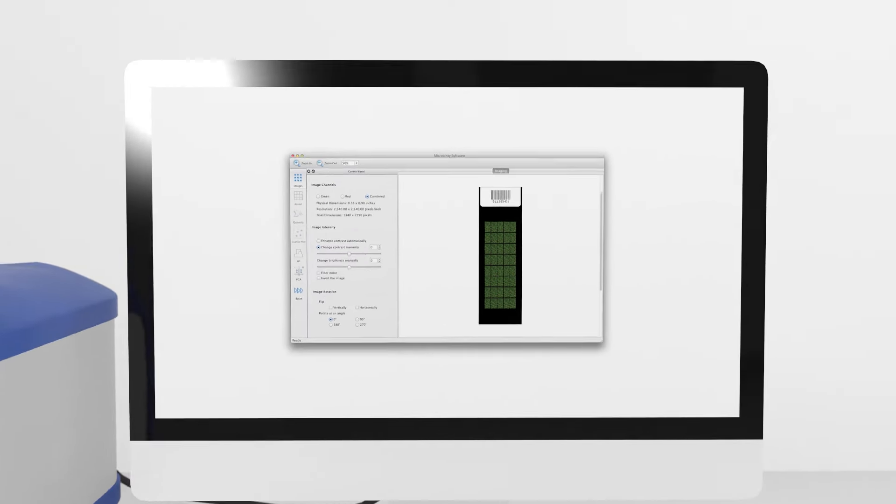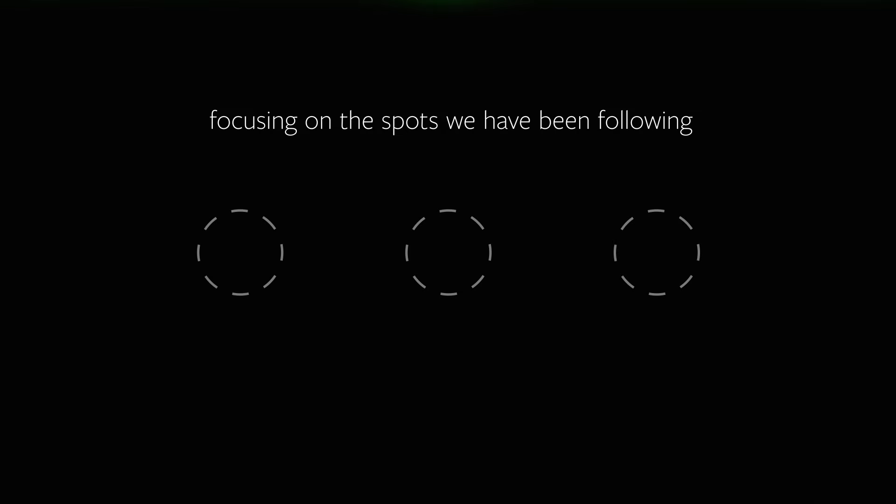We'll examine the next phase of the process, keeping our focus on the three spots we've been following. First, a green laser scans the microarray. The resulting image is stored on a computer for later analysis. Now it's time for the red laser. This image is also stored on a computer for later analysis.